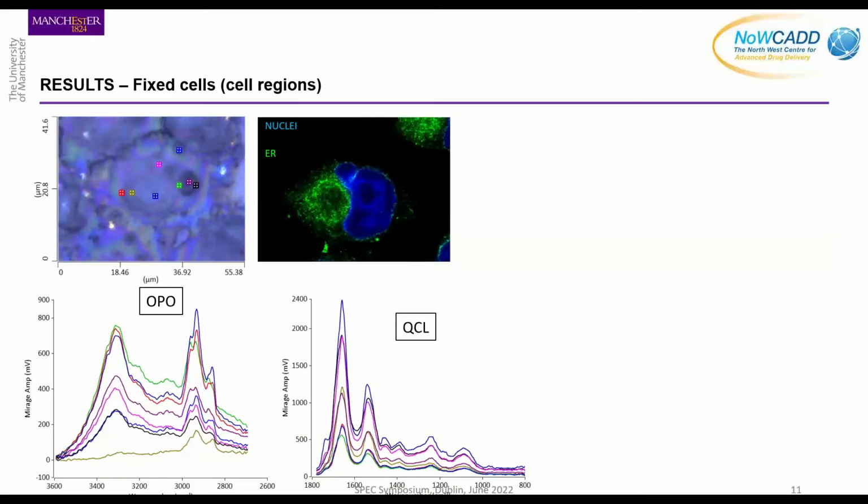However, these are MIA PaCa cells, which is a pancreatic cancer cell line. But basically, we found one that looked almost exactly the same, in the same orientation. And you can see this is actually stained for the nucleus here. So it's got a large nucleus, it's got a nucleoli here. And then this is actually the endoplasmic reticulum that has been stained. And you can see that there is going to be some match-up with this particular cell.